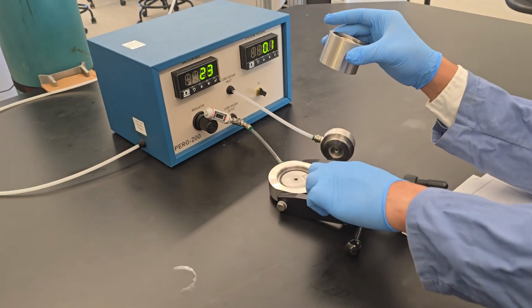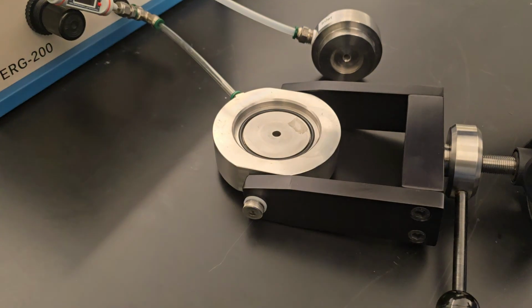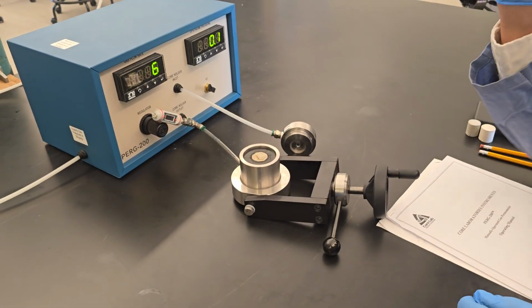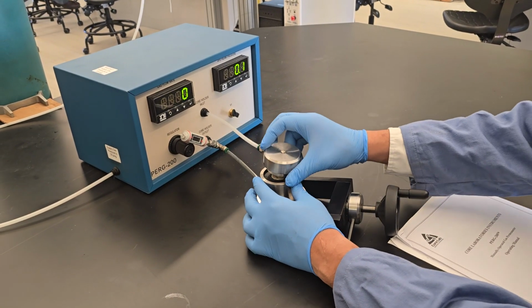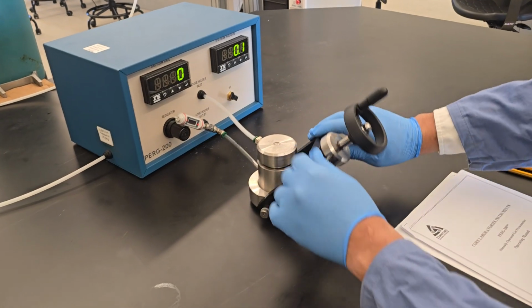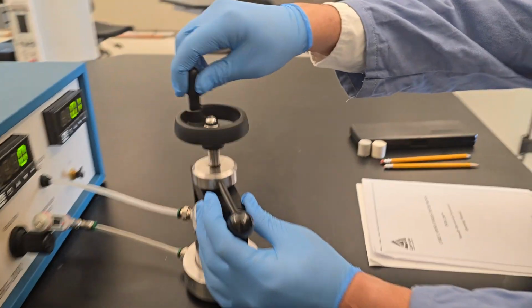Before you put it in the base, you make sure that the O-ring is there. Right? The O-ring is there, no other fluids. So I put this here to prevent any leakage. And after that, we get the top. So you see, this is the inlet. Down here we have the outlet. We put this one in the top of the sample, then that part goes here to secure it. So I hold this and I secure this.